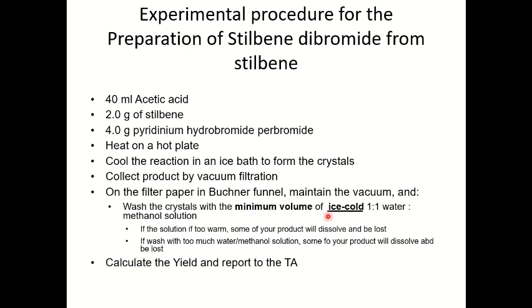Maintain the vacuum, and also you need to wash the crystals with the minimum volume of ice-cold water. Remember that the ice-cold wash is a 1:1 water-methanol solution. If the solution is too warm, some of your product will be dissolved and will be lost. If you wash with too much ice-cold mixture, some of your product will dissolve as well.